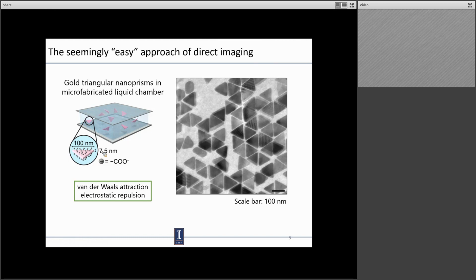The prisms' self-assemblies are very useful. They have special plasmonic coupling properties for applications such as nano-antenna arrays, which can locally concentrate electromagnetic fields, and they are also highly anisotropic in shape. So we were just curious how the shape anisotropy will induce interesting self-assemblies.